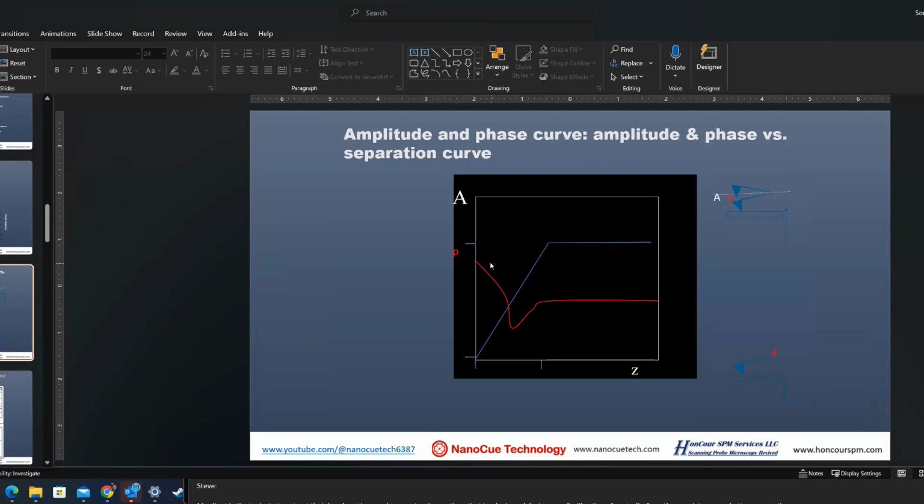There's no straightforward explanation other than yes, there's a water layer, and other forces can also be possible because of the attractive force or intermolecular force. But has anybody actually seen that water layer? I have never seen a water layer because it's just not visible. So using a water layer is a very good explanation of what we have been observing.